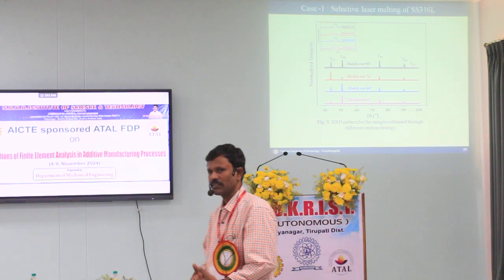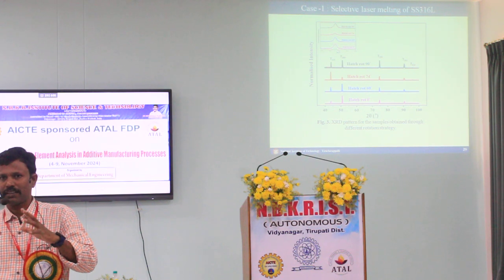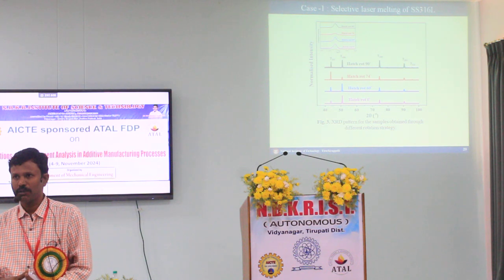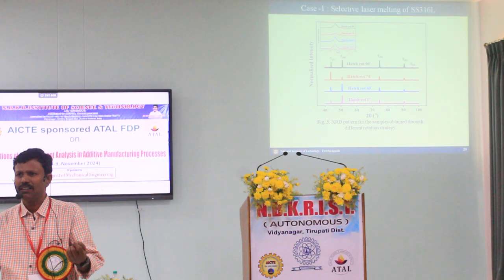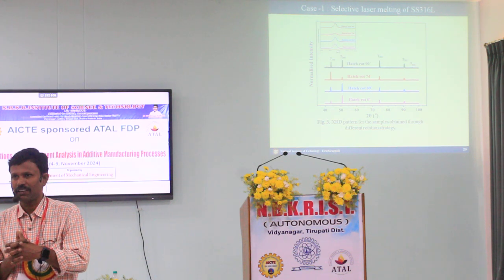The basic microstructure, as I said, below a few microns, 2 or 3 microns resolution, we cannot see. Up to that, whatever finer details we are able to see, such as porosity, some interfaces, grain boundaries, only such things we can see. That's what we need at the first stage to understand.